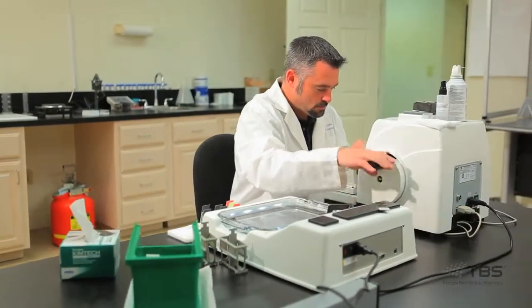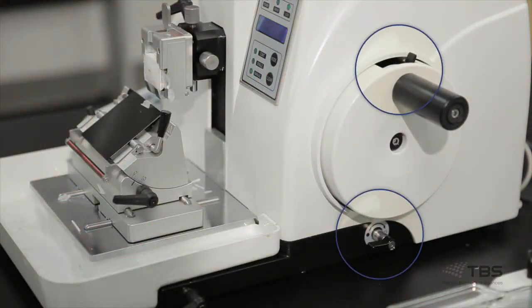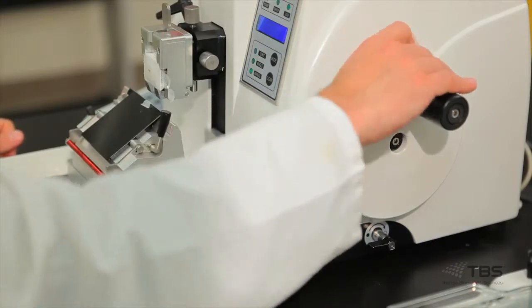Each Microtome is made using a Kydex housing that is xylene, dent, and scratch resistant, and all models come with two hand wheel locking mechanisms to secure the wheel in any position.